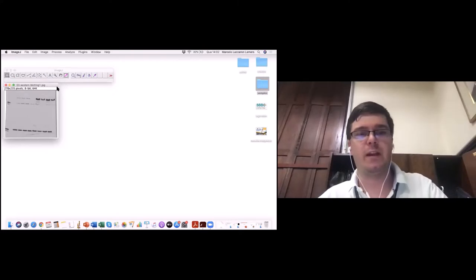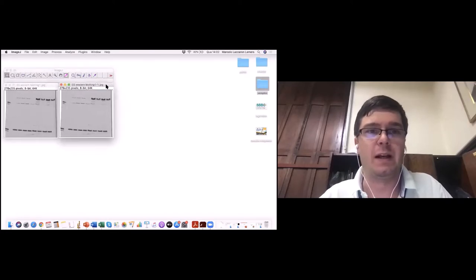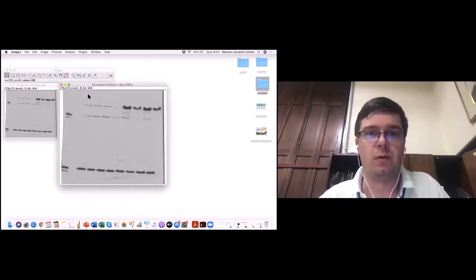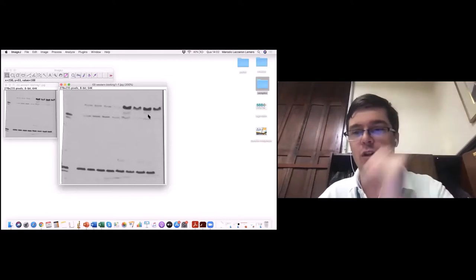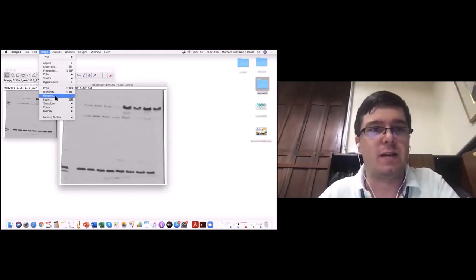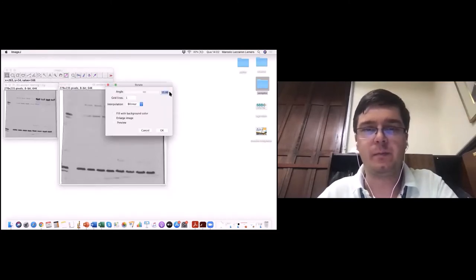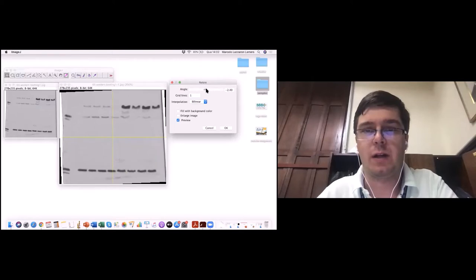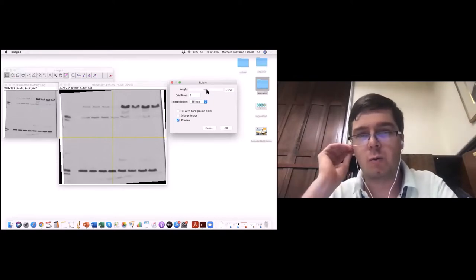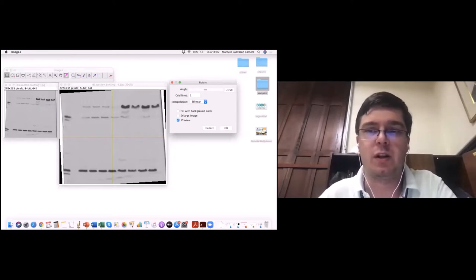Aqui um exemplo de Western Blotting. Lembrando: sempre tenho a original e uma de trabalho. Vou duplicar a imagem e dar um zoom. Para fazer a densitometria dessas bandas, primeiro ponto: vocês podem ver que está meio torto. Vamos fazer a correção utilizando a função Image > Transform > Rotate. Temos a opção de colocar o preview e dizer o quanto vamos rodar, fazendo um ajuste para deixar a imagem alinhada. Vamos dar OK.